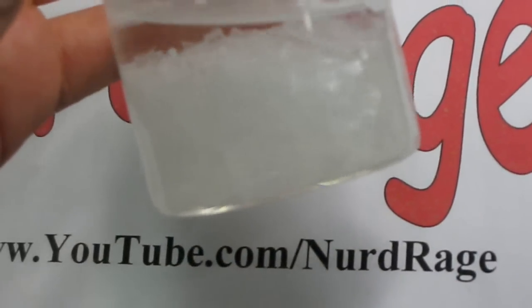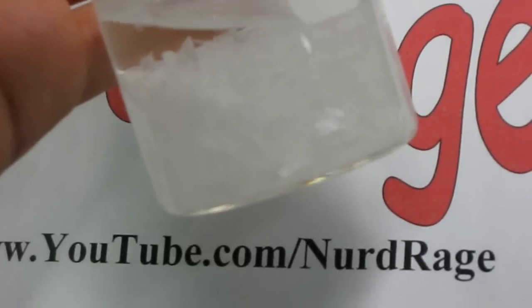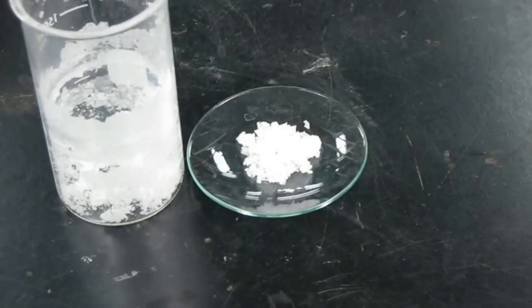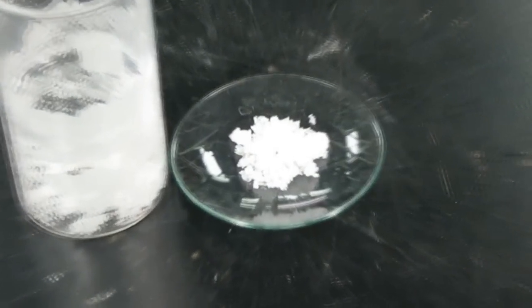When the solution cools down, crystals of silver nitrate will appear. Leave the solution out to completely evaporate — this might take several days. Eventually you'll have these dry crystals of silver nitrate. You can crush them into a powder for easier handling.